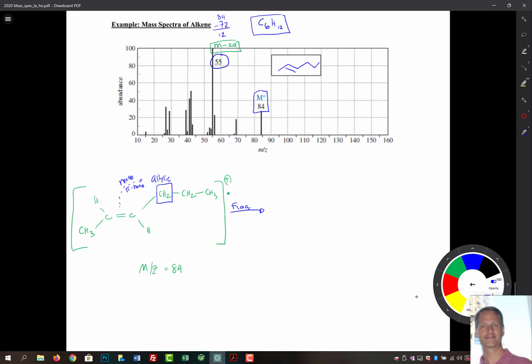Okay, so then if we were to take that position and do a cleavage right there, well, let's look at what we get. You get a CH3, carbon, HH, CH2. Right? Here's another way of doing this, by the way. You just break the bond. So a CH2, CH3. So where is it better to put the plus charge? Here, because that's allylic. And then that would leave you with a radical right there.